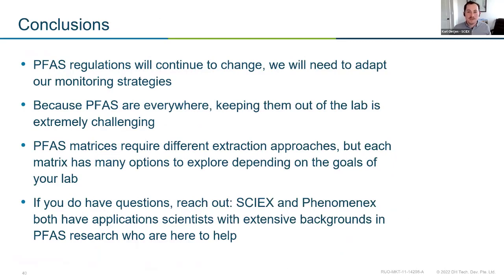One of the things I just want to mention quickly is these PFAS regulations are going to continue to change. I mean, we have 1633, right? And as Sam went through, there's a variety of sample preps for different matrices. So it can be confusing, and it can be challenging because PFAS is essentially everywhere.